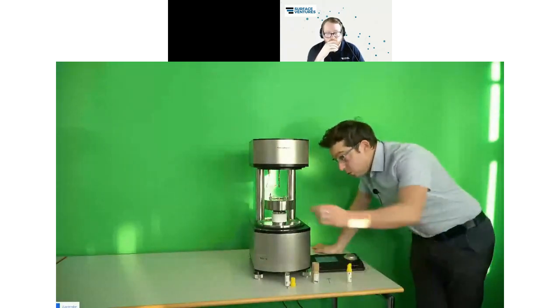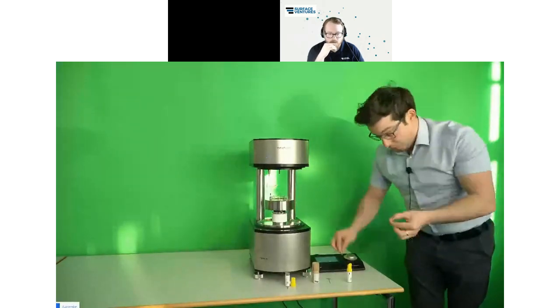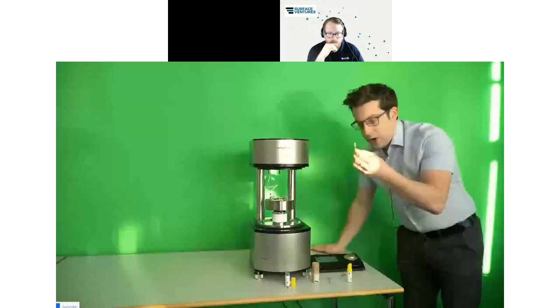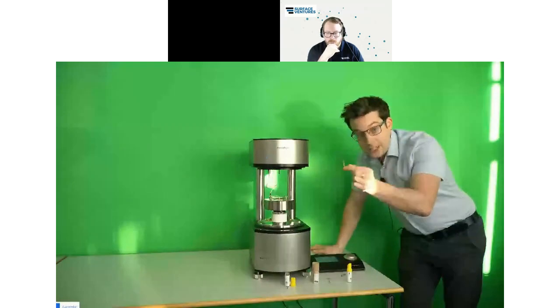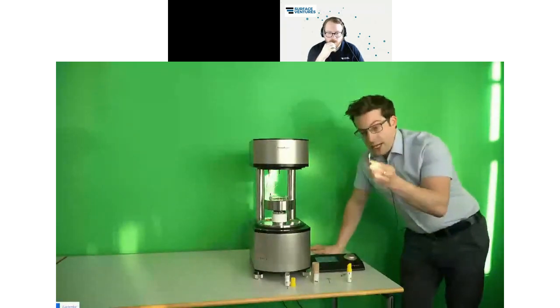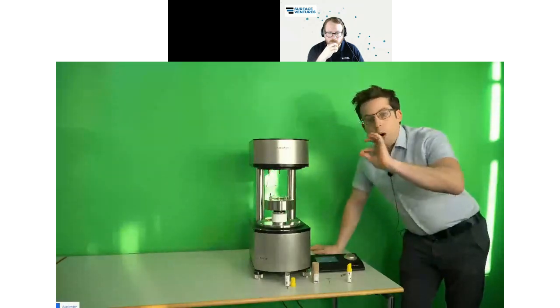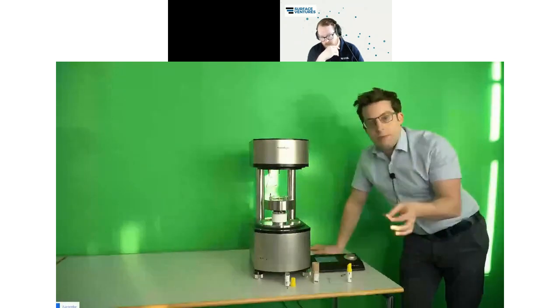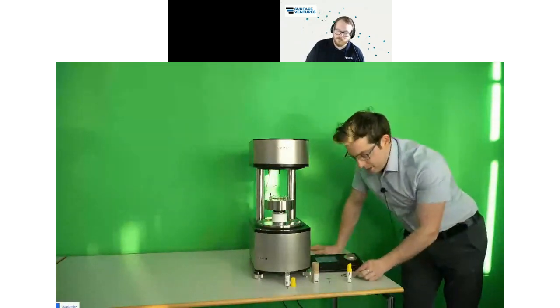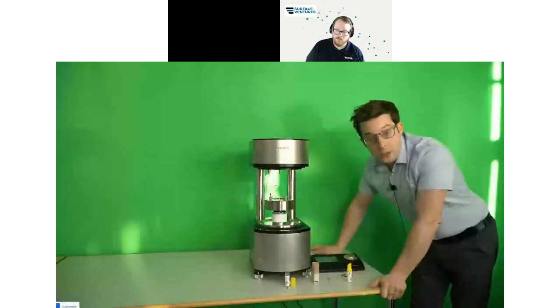So now we can take out this implant. And now what I want to show you quickly is, if I treat this implant with plasma, what is happening? But for this experiment, I use another type of implant, because this implant here, you have seen already without any treatment, was a very, very, very hydrophilic implant. But the other implant that I have here with me on the table is not so hydrophilic.